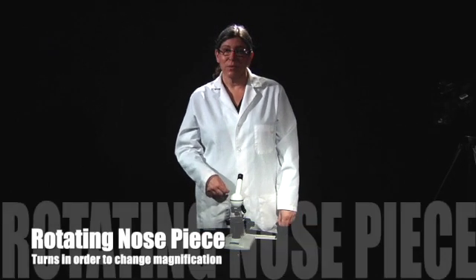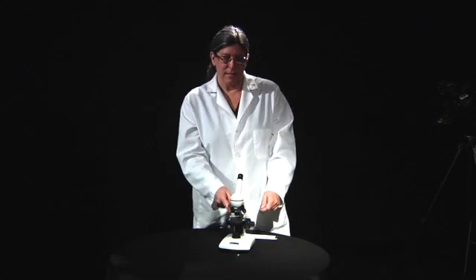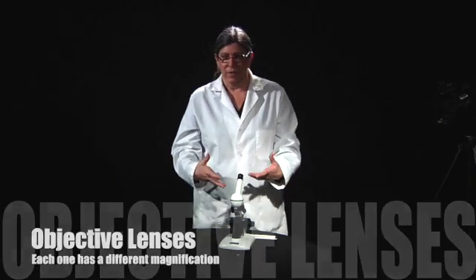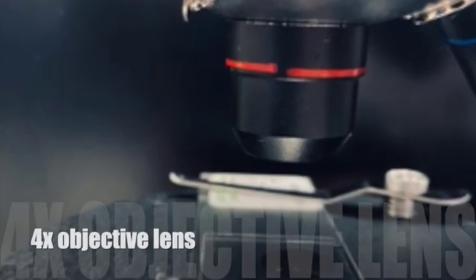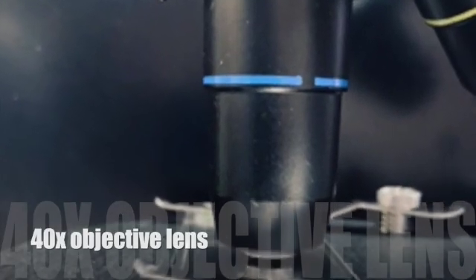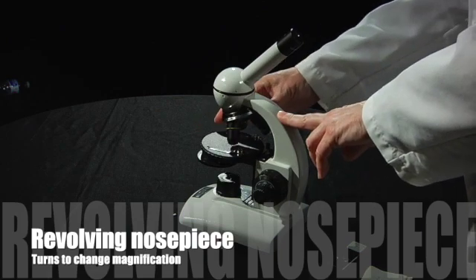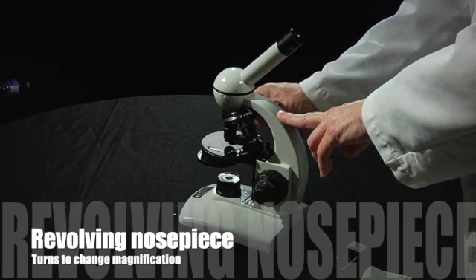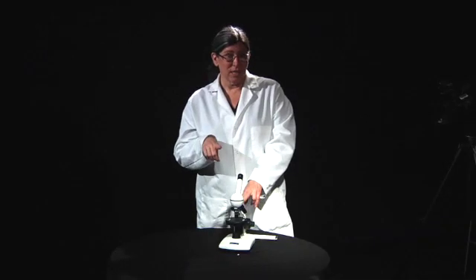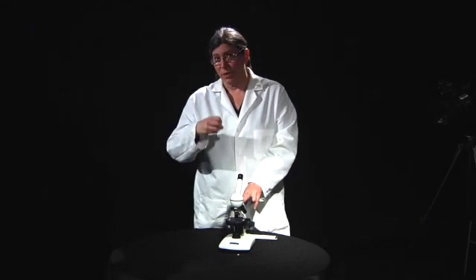Next we have the rotating nosepiece. On the rotating nosepiece there are three objective lenses — their name is objective lens — and there are different magnifications: a 4x, a 10x, and a 40x lens. If you want to switch between those lenses, you just turn the rotating nosepiece and click it into place. If it doesn't click into place, you won't be able to see anything because light won't shine through.